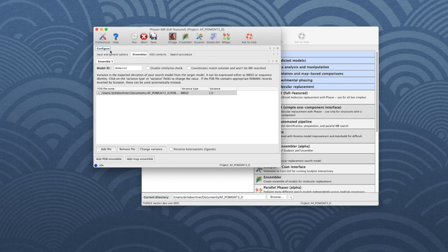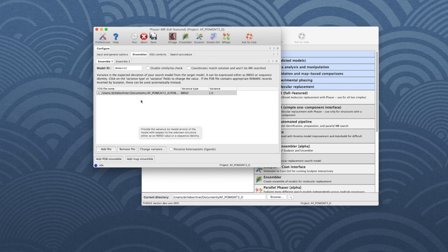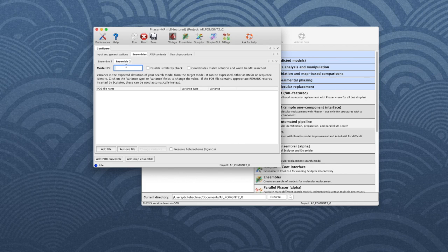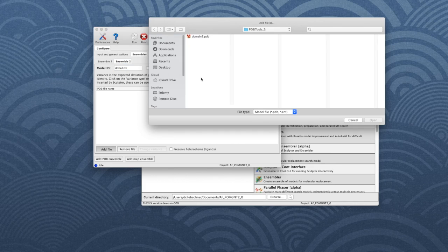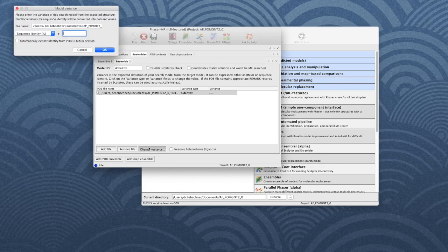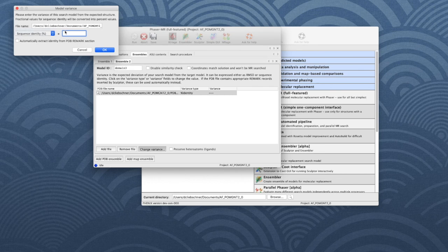Now let's add the second search model. Click the Add PDB Ensemble button and then click on Ensemble 2. We name this one domain_3 and this time we add the file domain_3.pdb. Again, the RMSD is one angstrom.